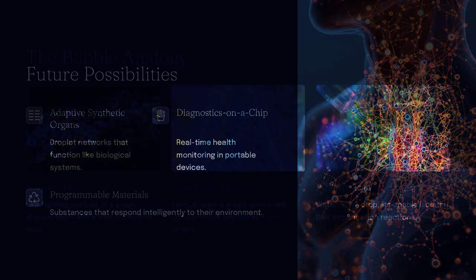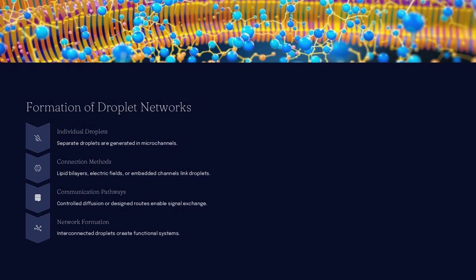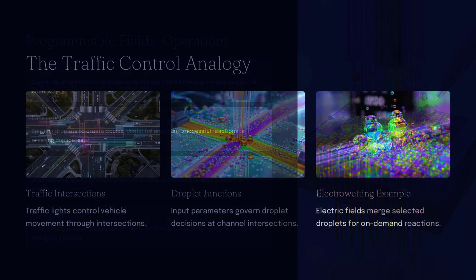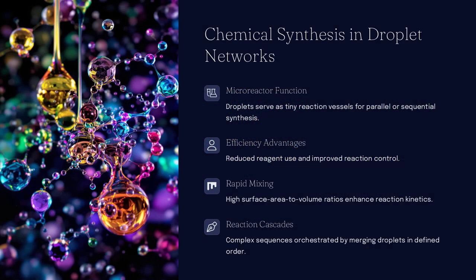chemical reaction pathways. One striking example: researchers have created droplet arrays where each droplet contains a specific reagent, enzyme, or cell. When needed, the droplets can be fused together to initiate reactions on demand, almost like telling parts of a biological system when and where to activate. This is particularly useful for high-throughput screening and drug discovery. Instead of running one reaction at a time in a large beaker, thousands of reactions can be tested simultaneously in a droplet network occupying just a few square centimeters.